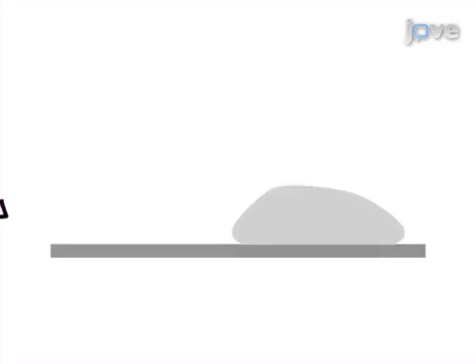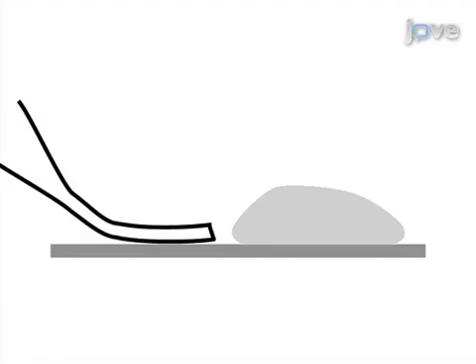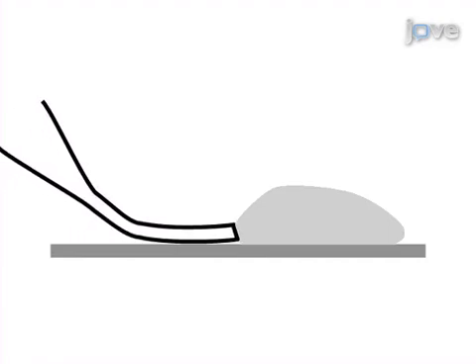The pipettes are mounted onto a fine micromanipulator positioned on the stage of an inverted microscope, and the tip of the pipette is brought into close proximity of a cell.